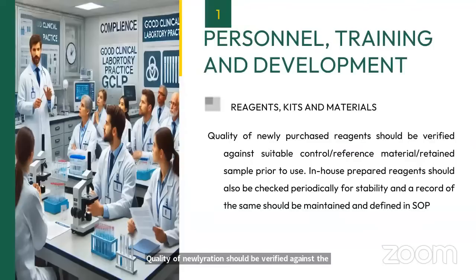So basically, lot verification or kit verification should be carried out whenever you are purchasing any new reagent or new chemical. The quality should be verified against your standard controls or against your standard reference material or any samples from the previous testing procedure. So appropriate kit verification and lot verification should be performed for each of the reagents.